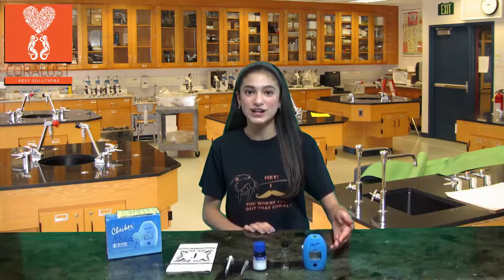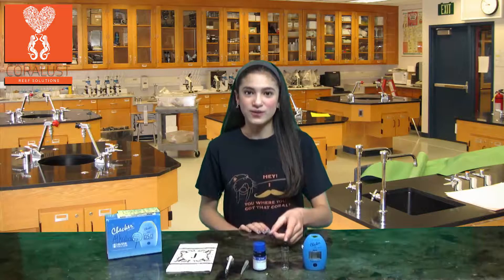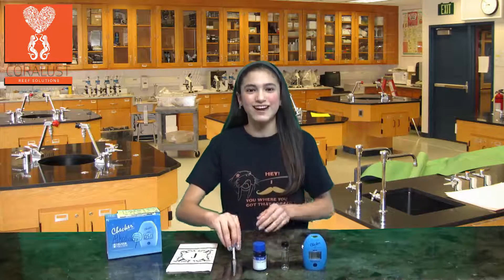This is what you're going to find in your testing kit: the HANA Checker instrument, the instructions, the vial, the alkalinity reagent, and the syringe. The syringe comes in two parts — just connect them and you're ready to go.